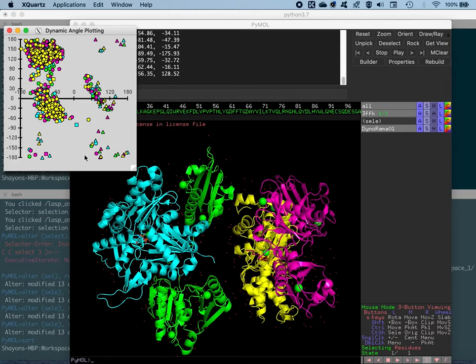So these outliers out here, as you can see, for the glycine residues in the triangles colored in purple belong to this chain out here, which is of the gelsolin. And these yellow ones, which are in circles, and some of them glycines as well out here, are colored according to the actin chain out here in the other subunit. And then you have the other color representations for the different chains as well.